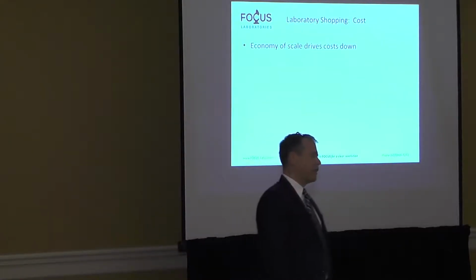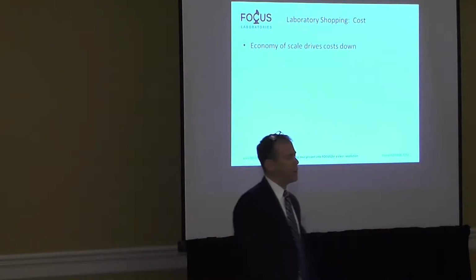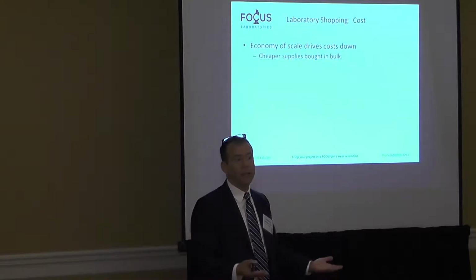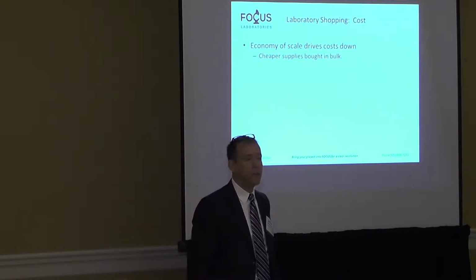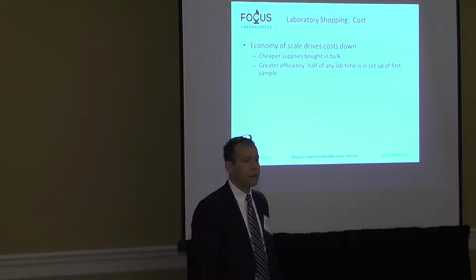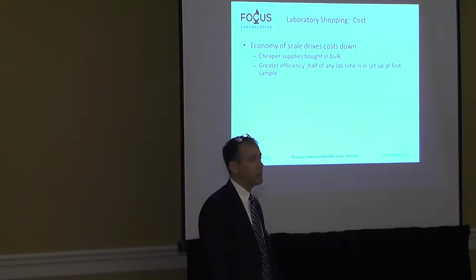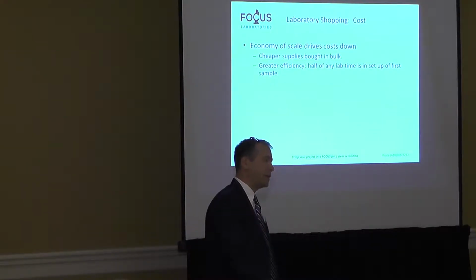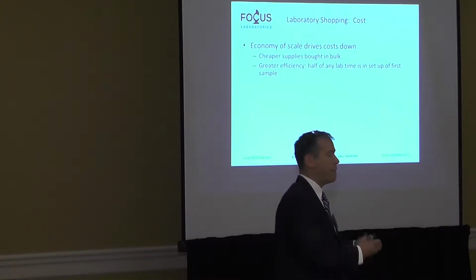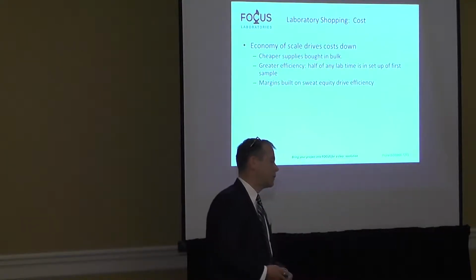Just to go back a little bit on the cost side, this slide's out of order, I apologize. When you're shopping for the laboratory, obviously economies of scale can drive prices down. We talked about environmental monitoring and how buying bulks of plates can save you money if we go out and do it ourselves. There's greater efficiency. Anybody who's in the lab business knows that more than half of the lab time is really in setup. If you're running one sample and you're spending all that time setting up, then you have to break it down for another sample. Or if it's a contract lab that runs 10 different batches of microcrystalline cellulose from 10 different manufacturers, they have that efficiency, which can be passed along in the cost.